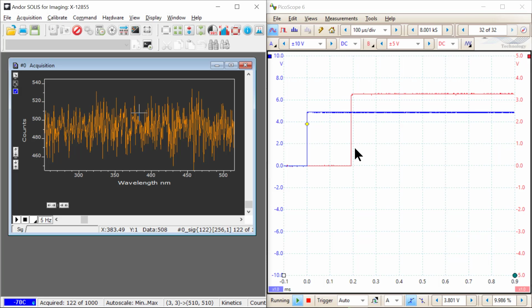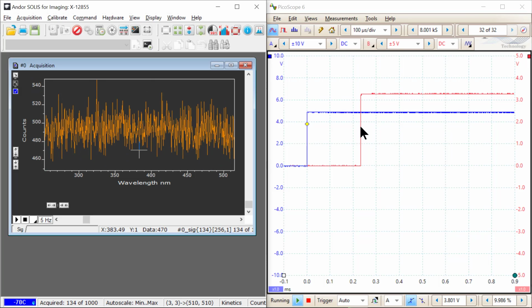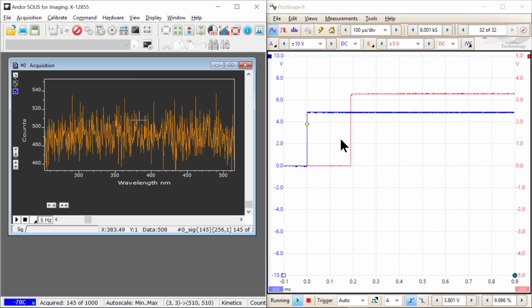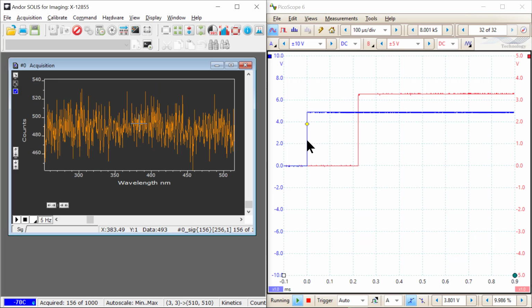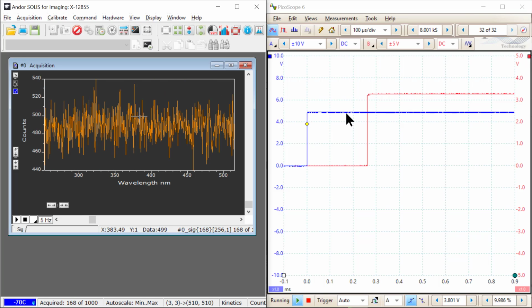But the thing is that, exposure to exposure, we don't know exactly in this case when, relative to our trigger, the actual exposure starts. So it's fine if we're monitoring the fire signal to catch when the exposure starts. But if we're saying, okay, I'm going to expect that my camera will come online at some extremely tight tolerance after the external trigger comes in, then you can be caught unawares by that.